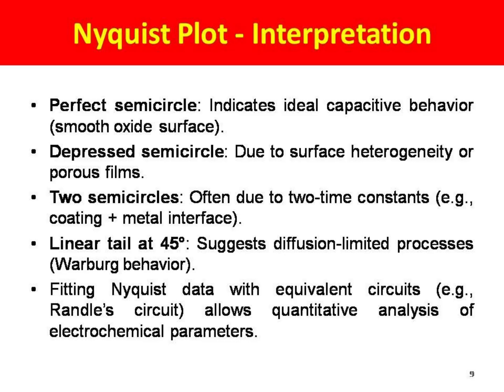Nyquist plot interpretation: a perfect semicircle indicates ideal capacitive behavior. If the plot is a depressed semicircle, it is due to surface heterogeneity or a porous film.